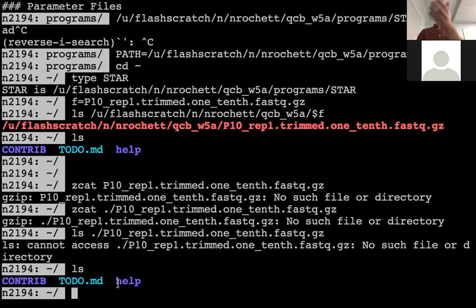So if that's where my program is running, and even with ls I can't find the file I was looking for, then either I'm not running from the right directory, or there's a typo in the file name, or something. And then you know what's going on. You know it's maybe the path that has a typo in it, or maybe the directory the program is run from is not the right one, and then you can fix that.